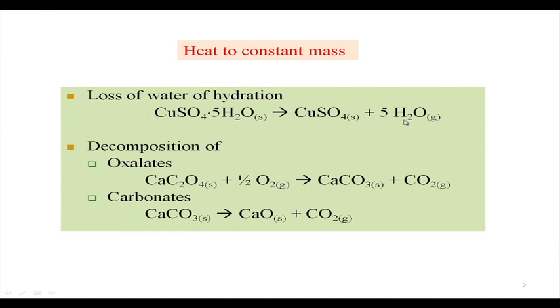And if I ask you to make these 3 samples, how will you make them? When a copper rod, copper strings, or copper foil is given to you, the metallic copper, which has been obtained from your ore or mineral of copper, can be solubilized in the presence of sulfuric acid.